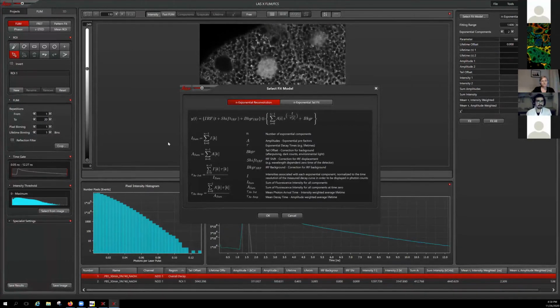So the answer to this question is how our system looks, how it is working, what the IRF shape is, and so on, as well as what I am measuring, what the fluorophore is. So you need also to know your sample. There is no specific answer, but short, in our case, I mean something between 250 to about 500 picoseconds.